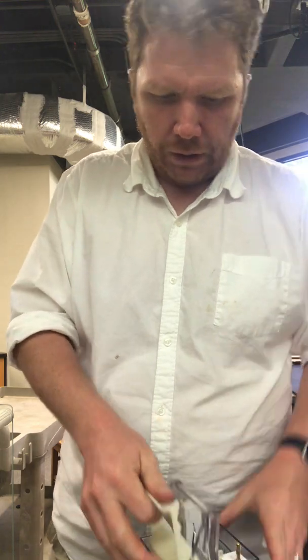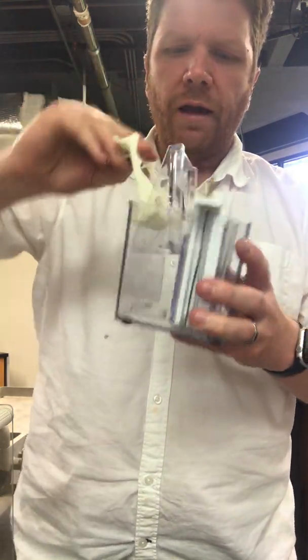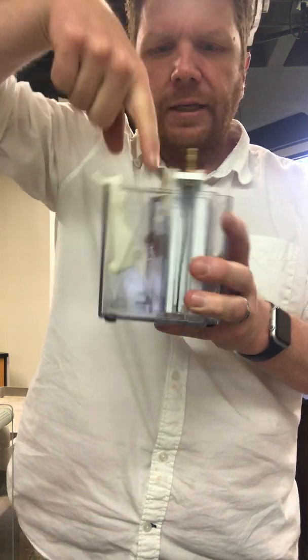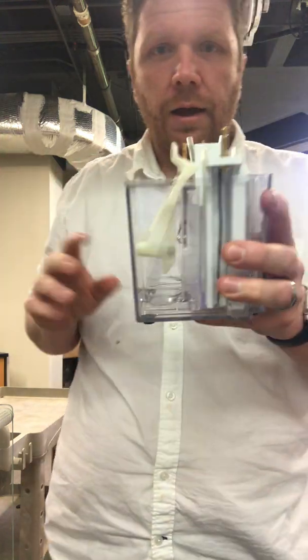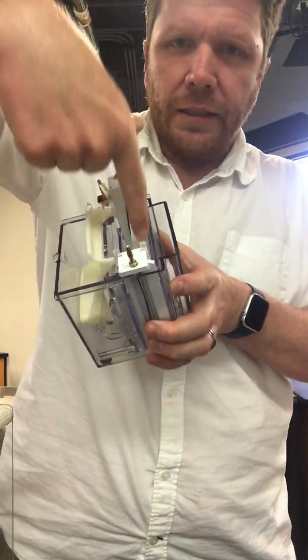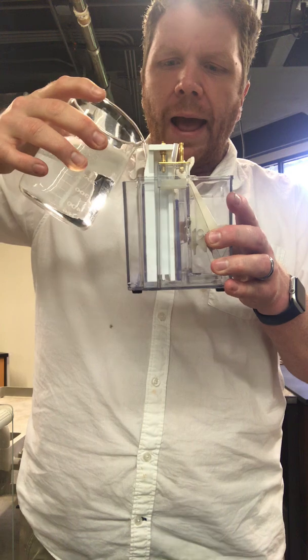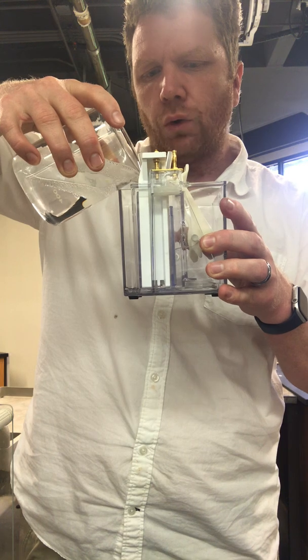What I need to do after that is take my sandwiching device and put it like this. I just dropped this in, and so what I have is basically my gel, my plastic sealed gasket, and my buffer dam. Now I want to close this and lock it in place. By locking it in place, I've created a seal in this central chamber. Now, I have this SDS-PAGE running buffer. I'm going to add this running buffer to that central cavity, in that central chamber.